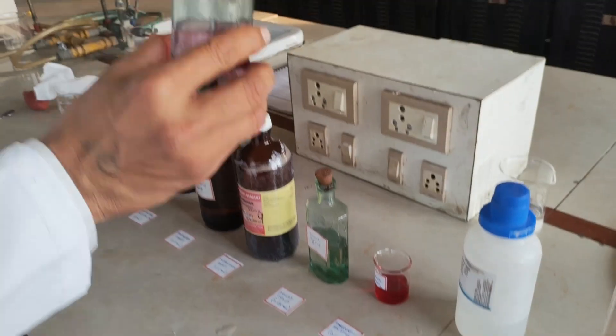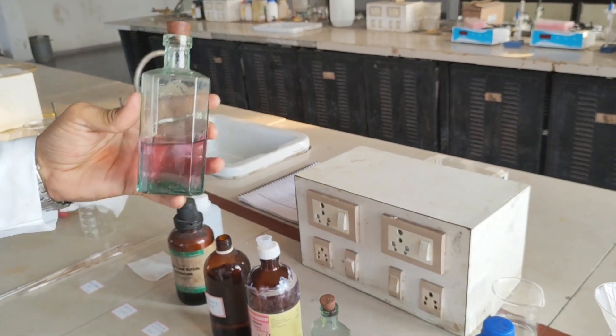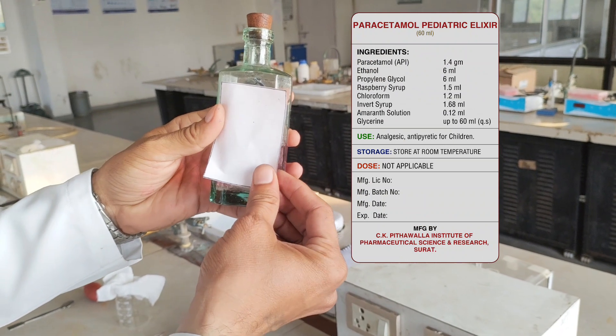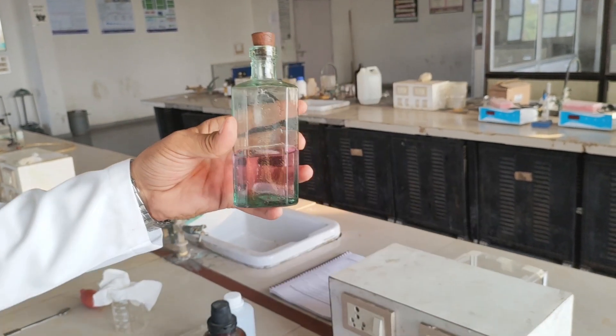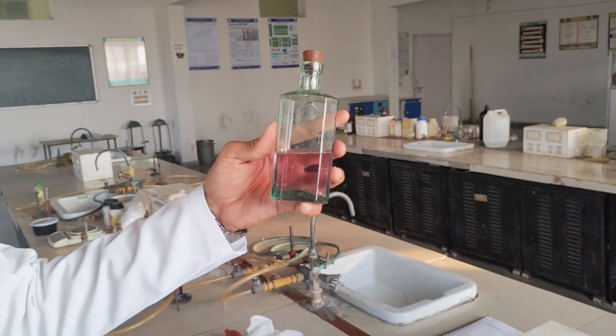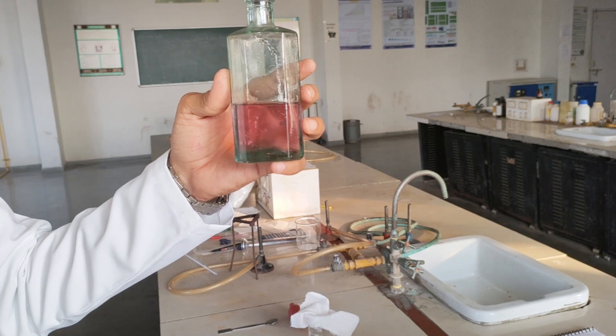After filling into the final container, put one cork and paste the label with appropriate information as per requirement. This is our paracetamol pediatric elixir used as an analgesic and antipyretic for children. Thank you.